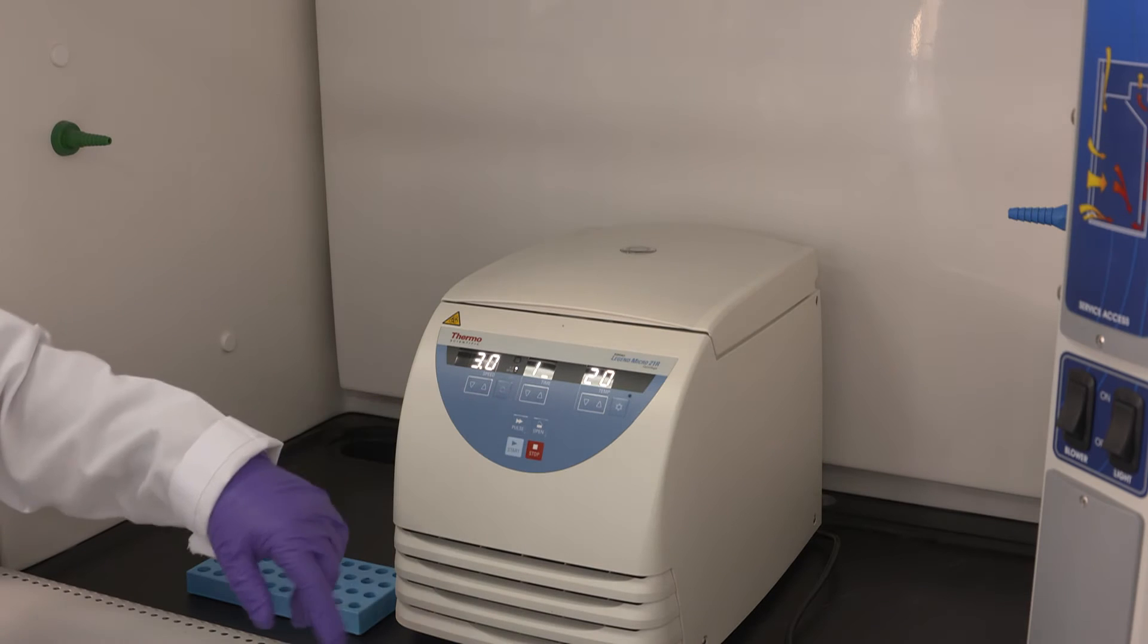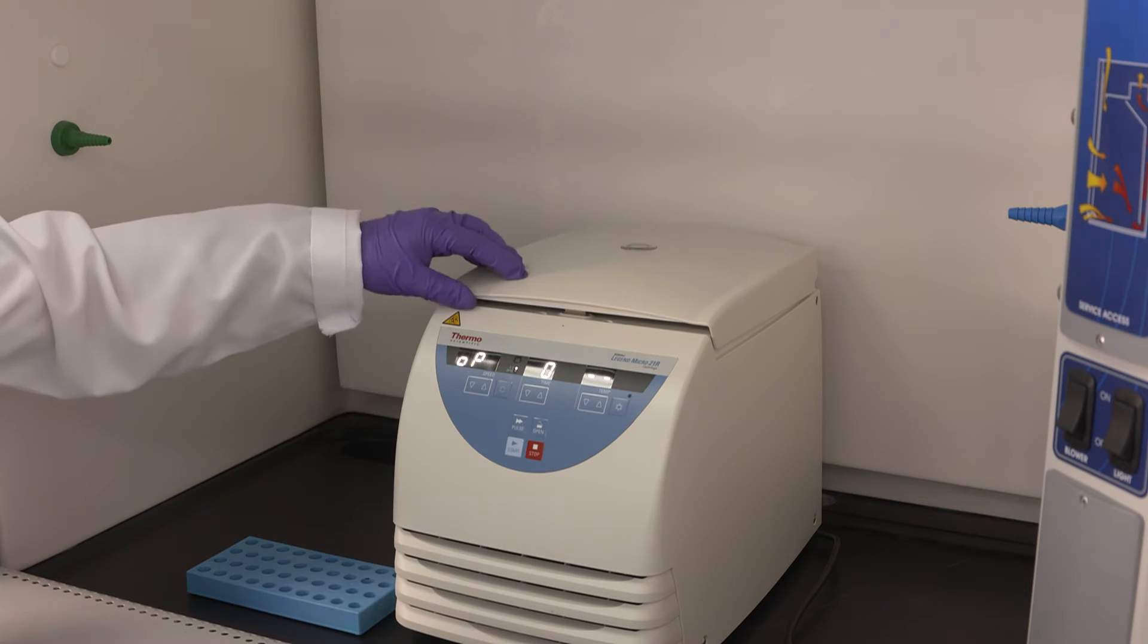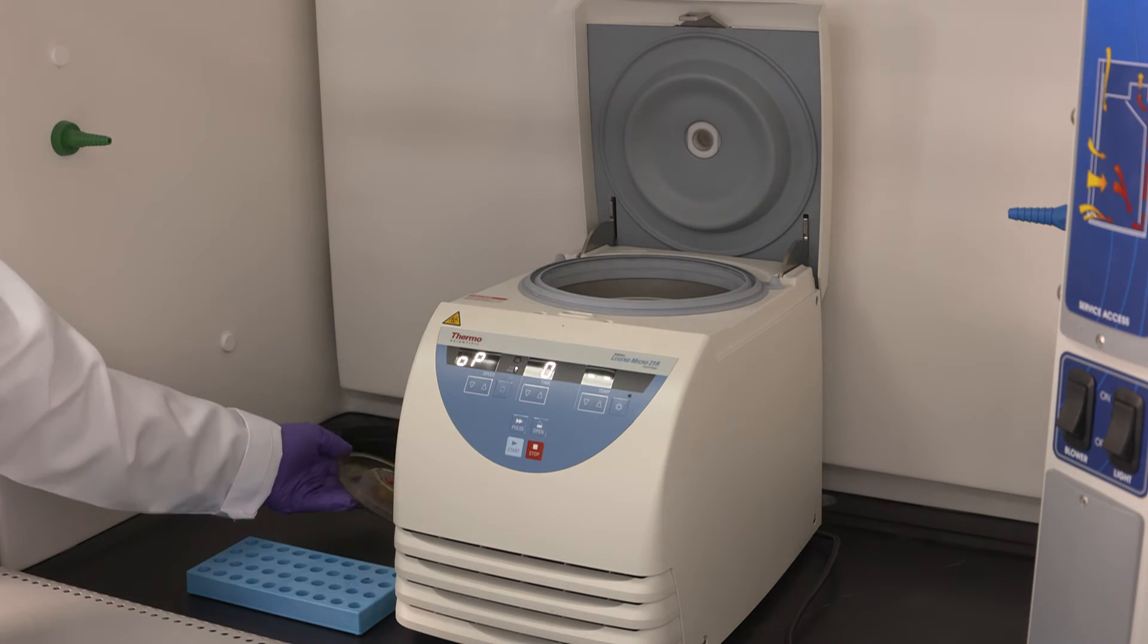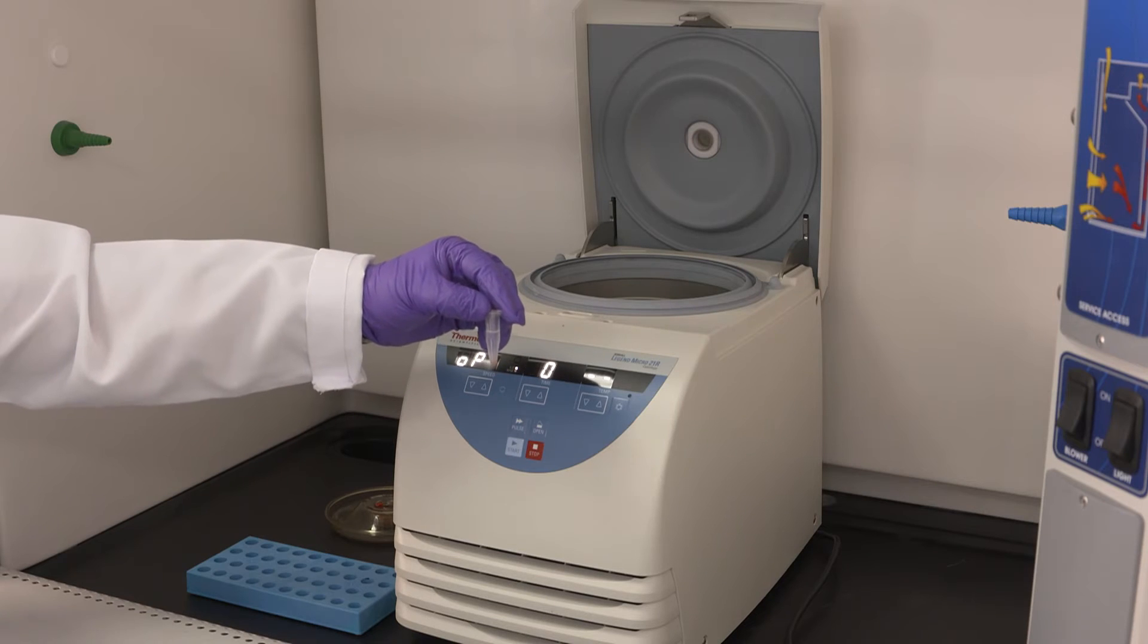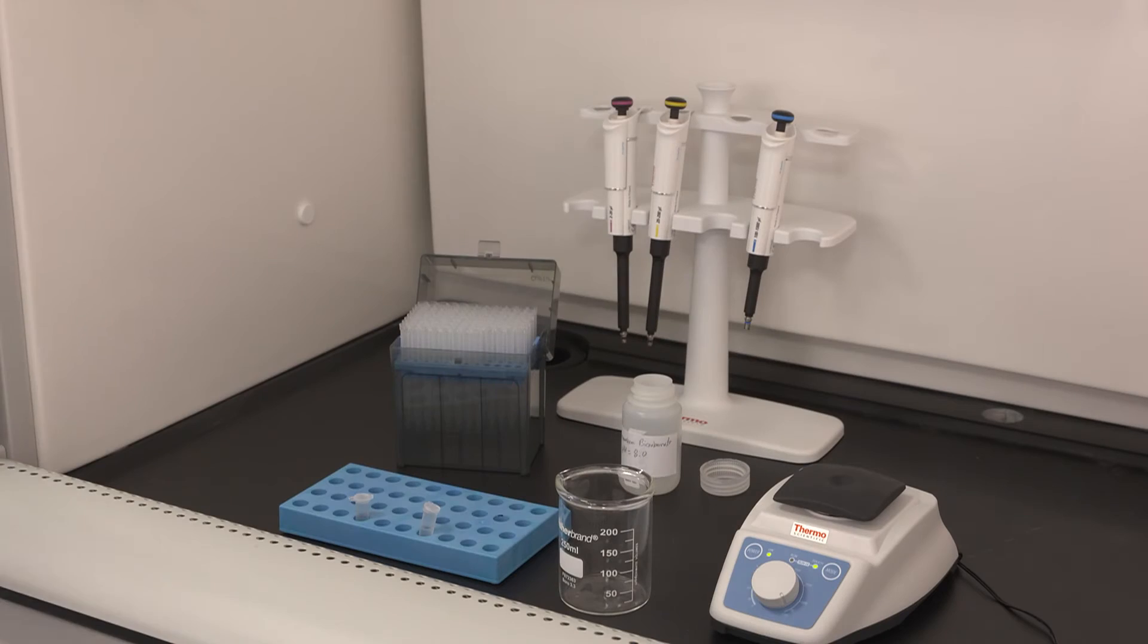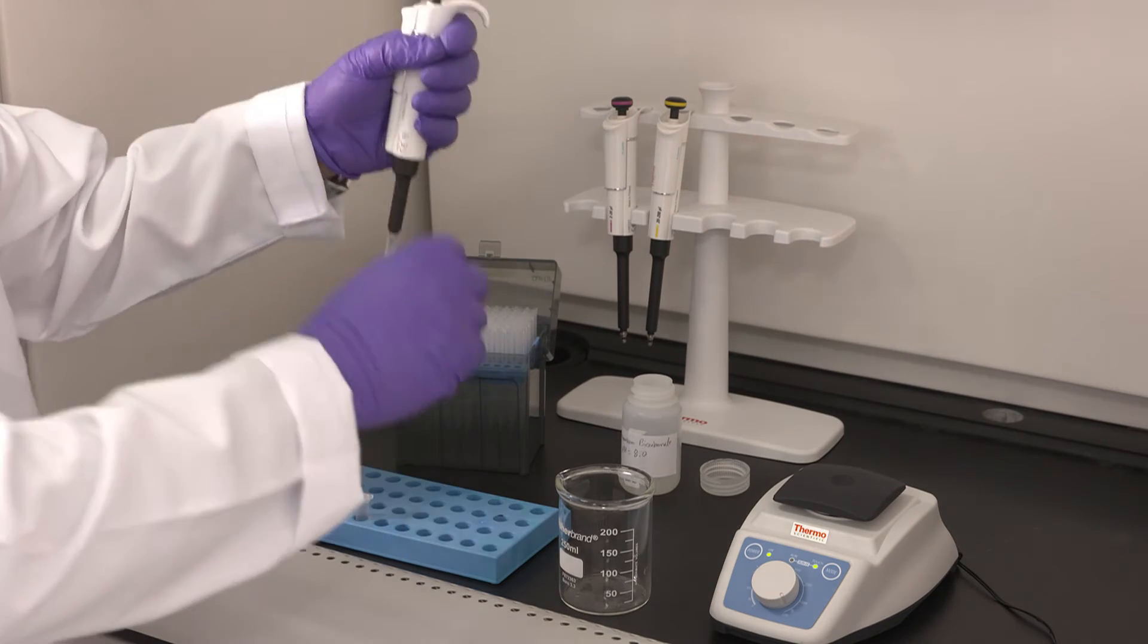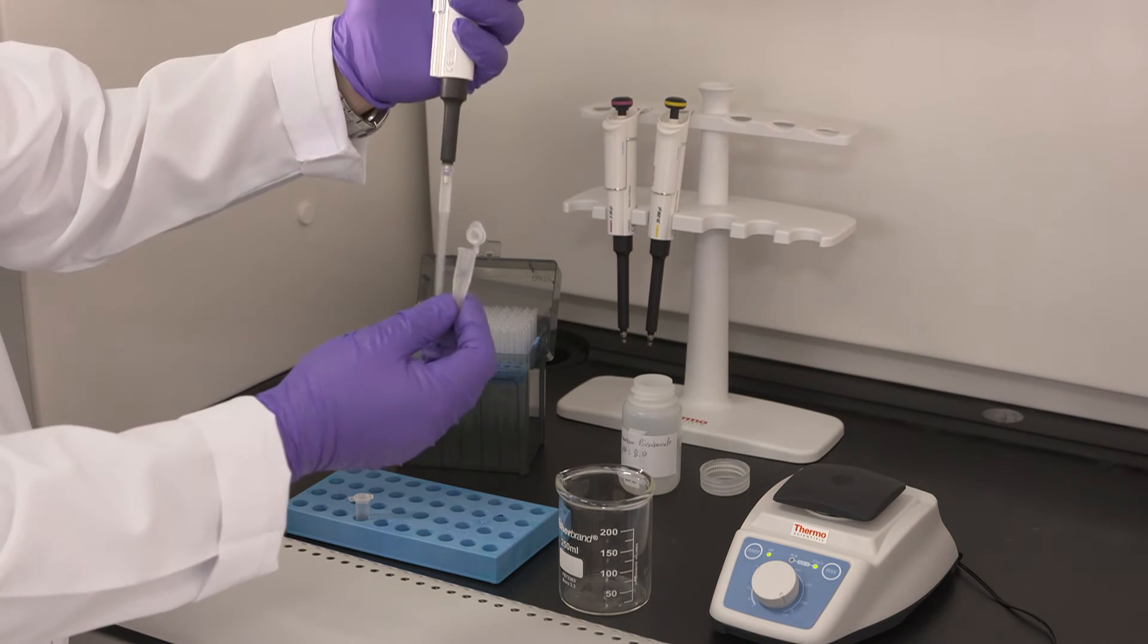Following 10 minutes centrifugation at 3000 g, we will observe the formation of a protein pellet and a liquid phase. We can observe the protein at the bottom of the tube and on the side of the tube, and we can clearly identify the liquid phase. Now we will remove the aqueous phase that contains acetone and keep the proteins.